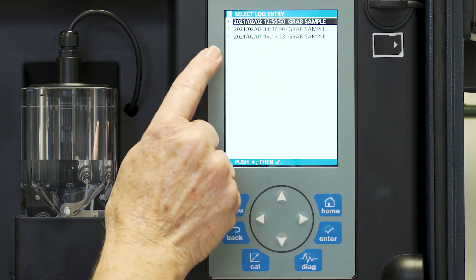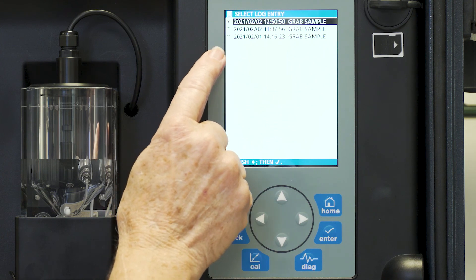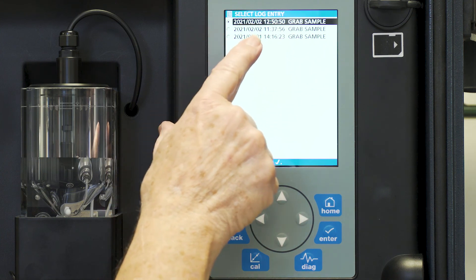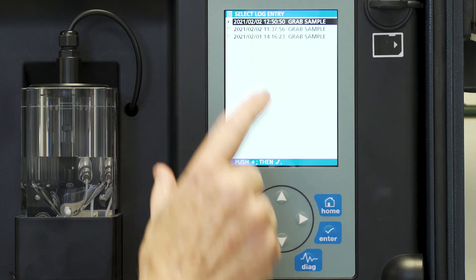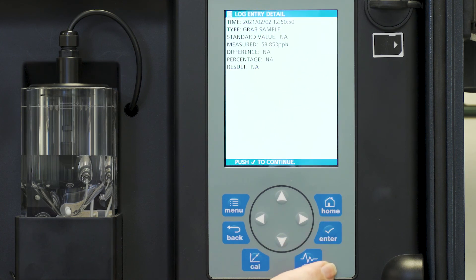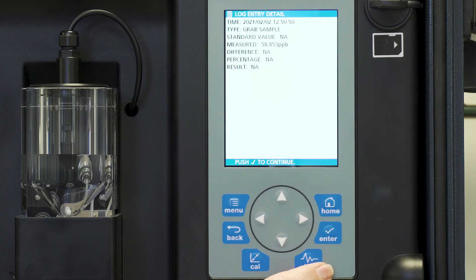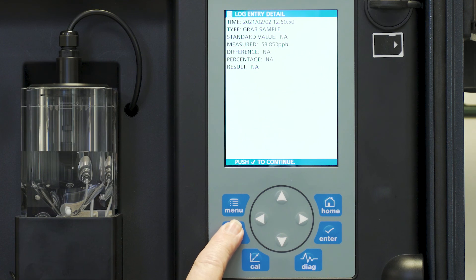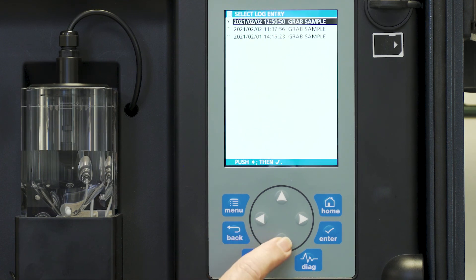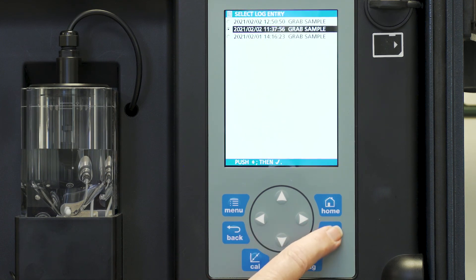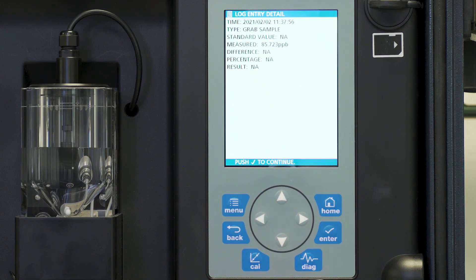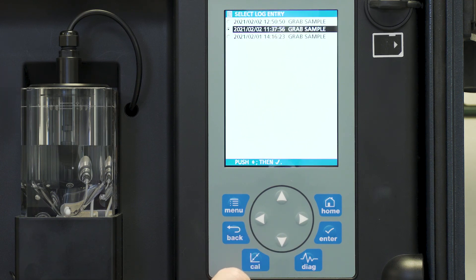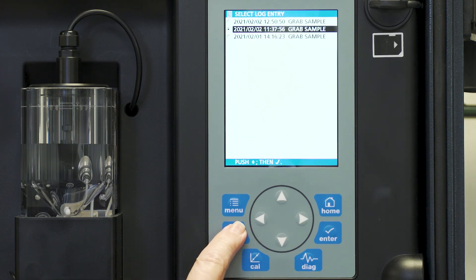And you'll see our latest reading that we just had today on February the 2nd. We press enter and then it will show us the value of that reading. I can also go back and look at a previous grab sample reading if I want. So every grab sample reading is logged into data.